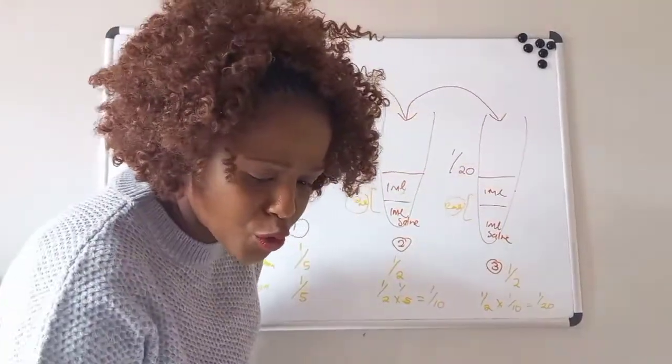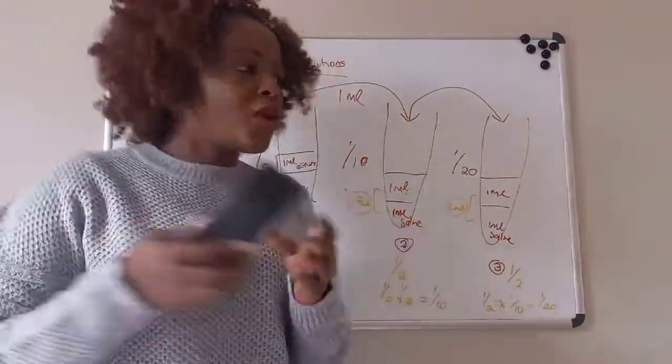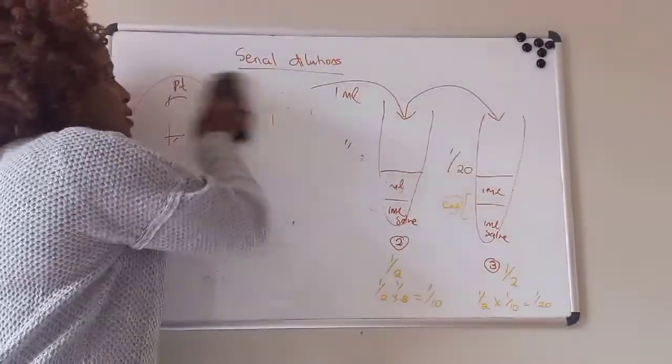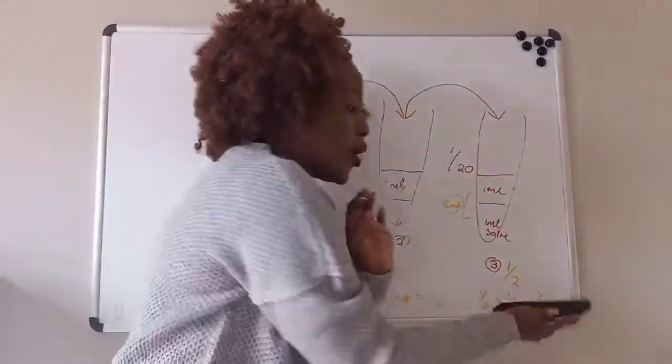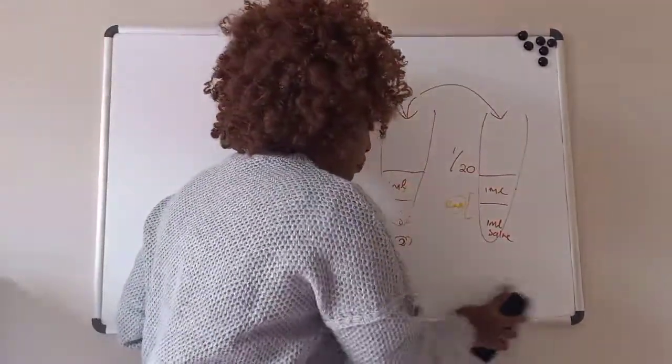So when will you use this in the laboratory? You will use it in most of the cases whereby you have a little sample from the patient.